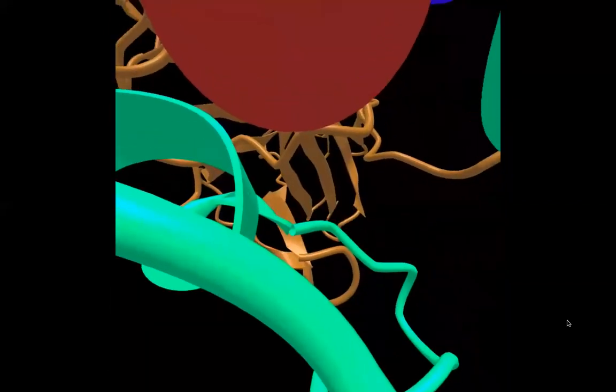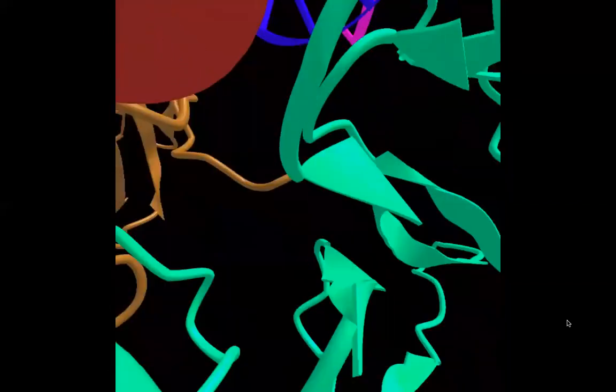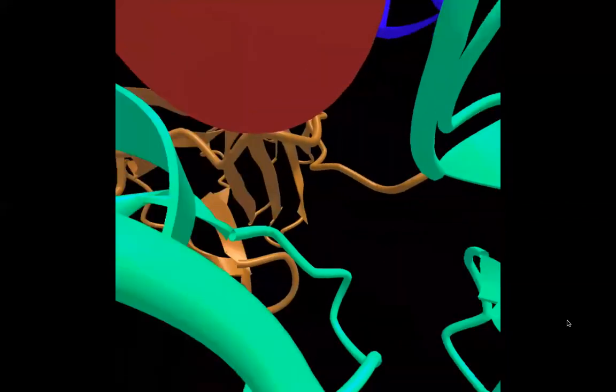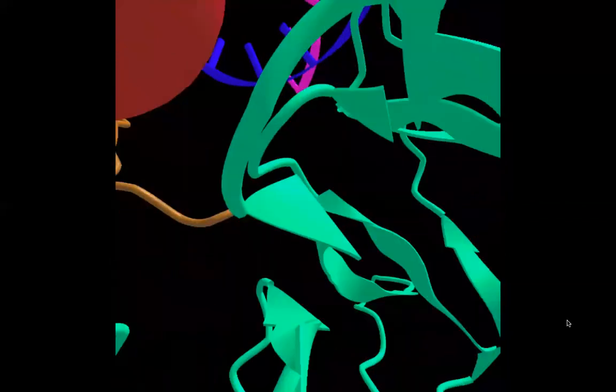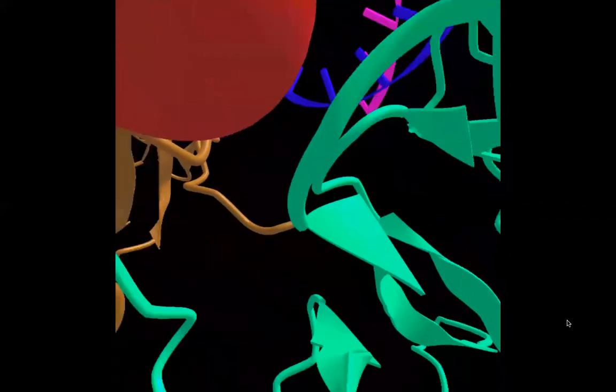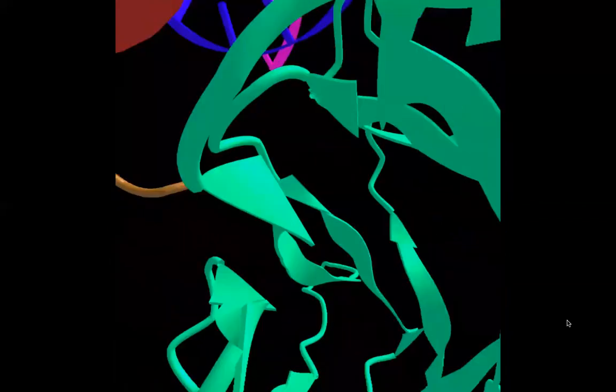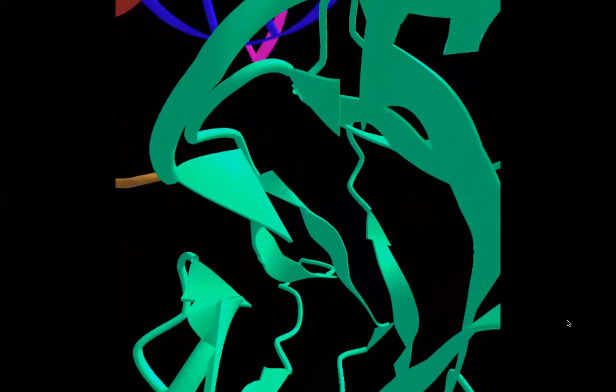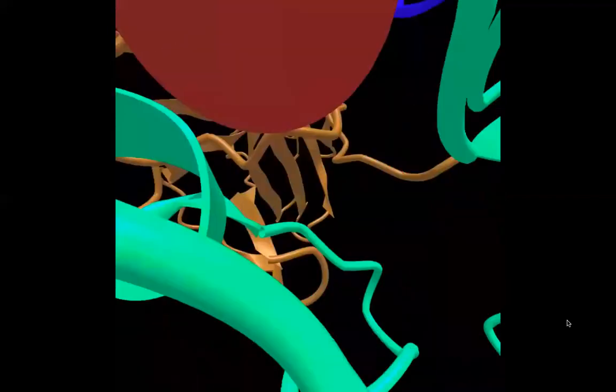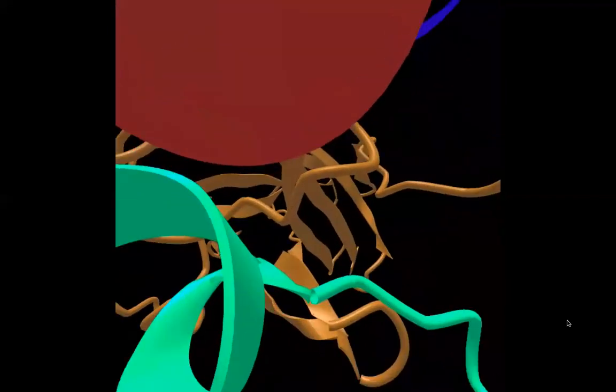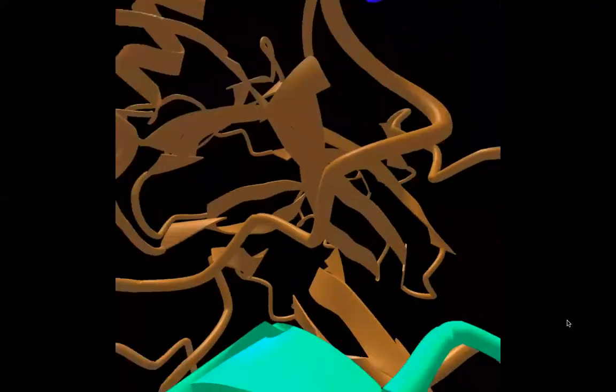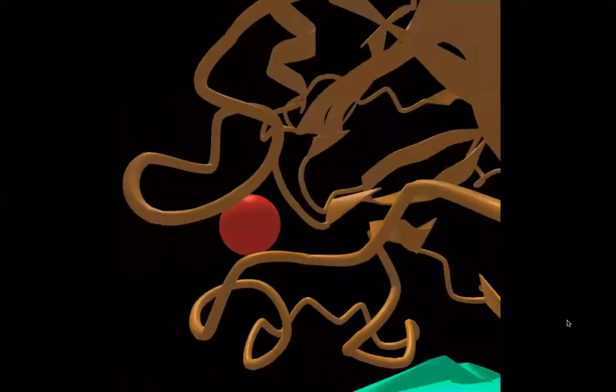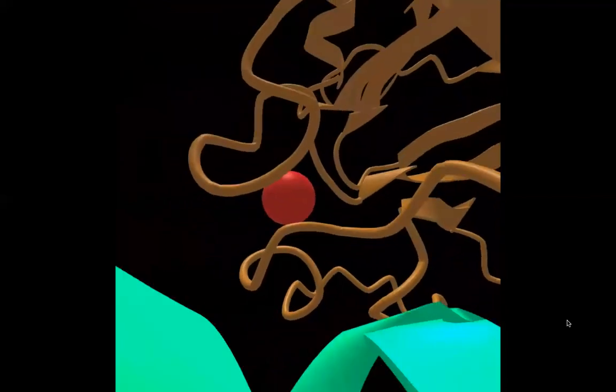At the beginning, you are in the center of the molecule, and you can use your triggers, the right trigger to go forward, and the left trigger to go backward.